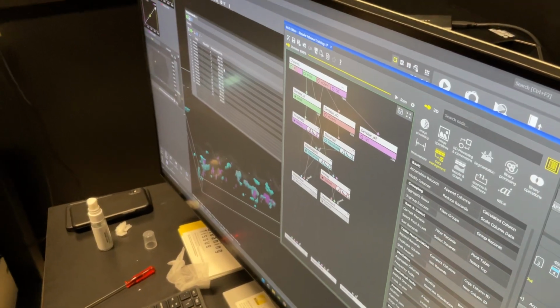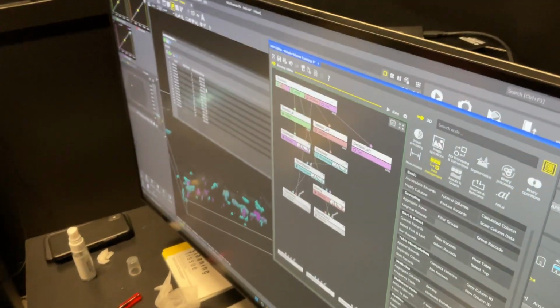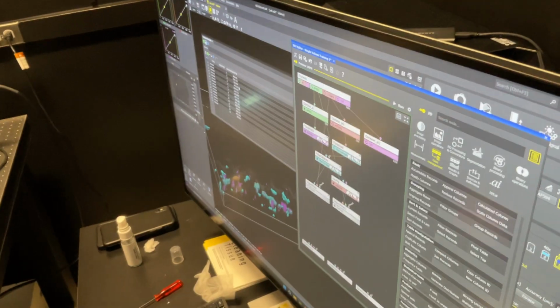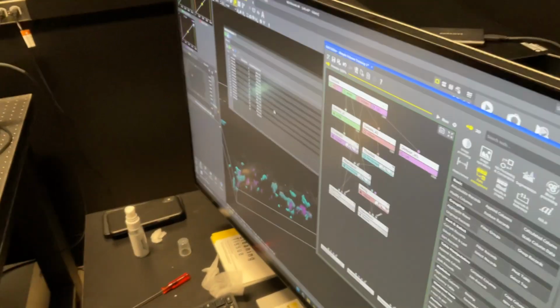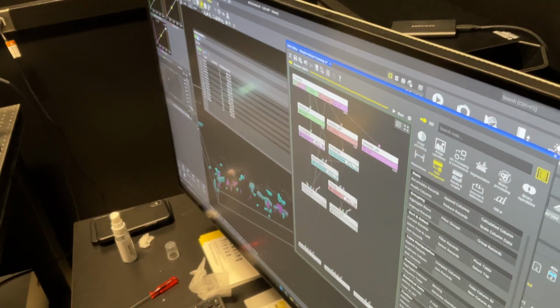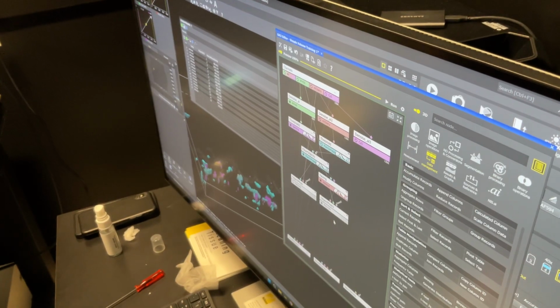So it's kind of weird, it's like a parent-child relationship, but it's not in our software. Parent-child is basically our way of saying this thing has things in it. But wouldn't it be possible to take the filter object macrophages and set a threshold of GFP and say GFP positive or GFP negative? You could do that too. That's probably one way you could tackle it.